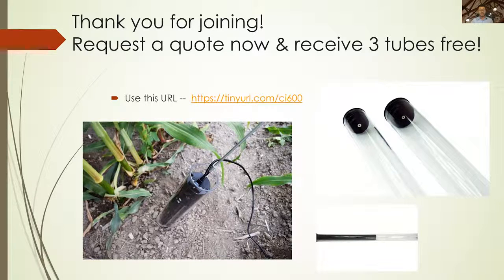And the next one is how sensitive the cameras are to soil types. Actually, as long as you're making sure that the scanner head is up against that acrylic tube, and the acrylic tube's not deformed or scratched up itself, it's very, very sensitive and able to pick up your different soil types. You can see each one of the visible scans. So you can see very rocky, very sandy, very clay, as I typically find where I'm usually from. But you can definitely pick that up pretty readily with the scanner.